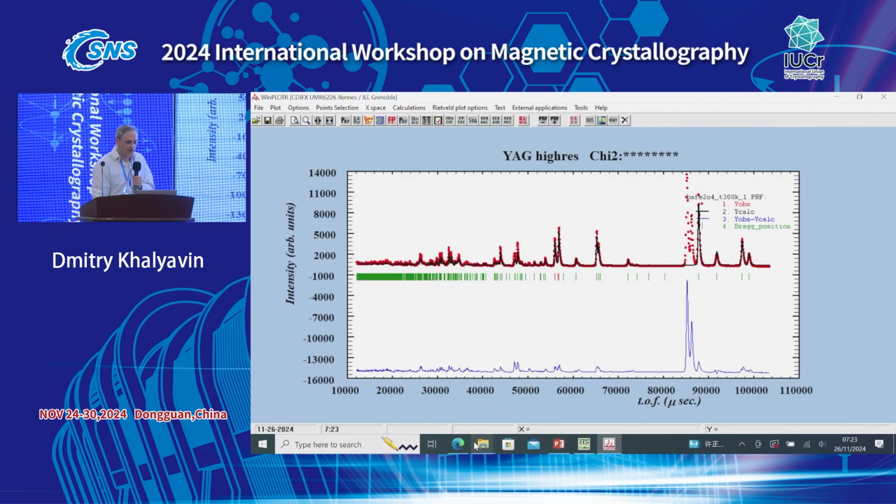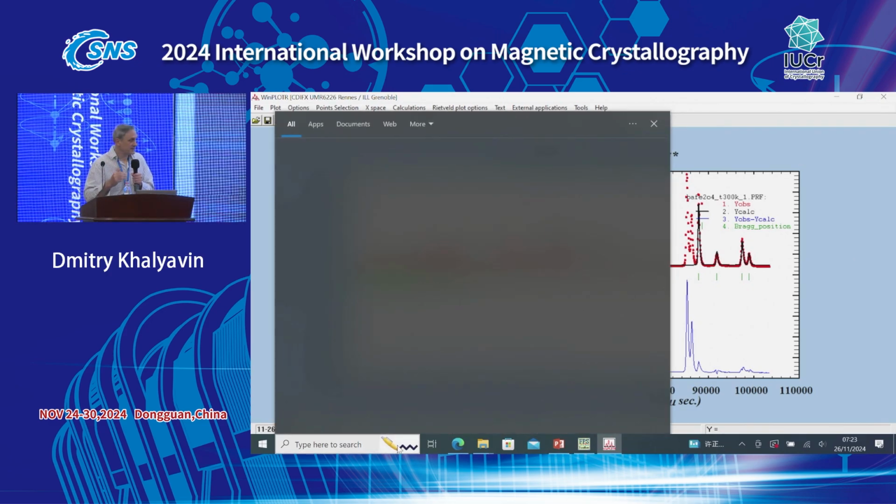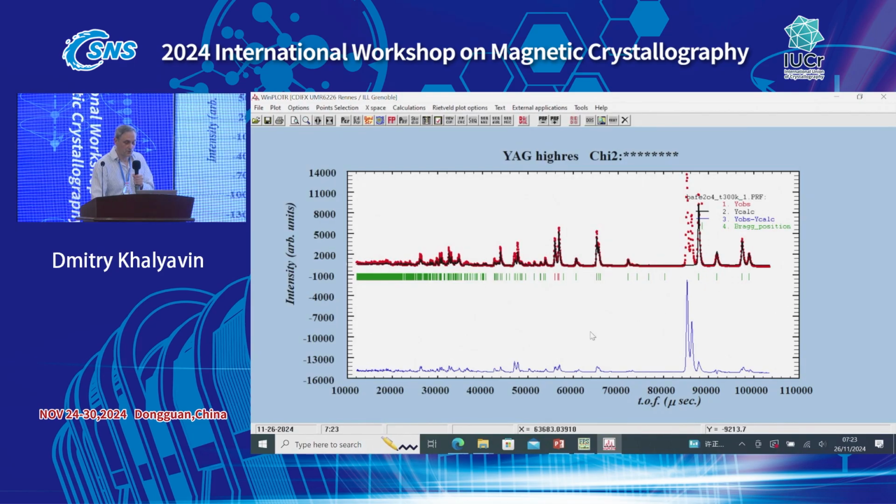And then, as a next step, as Manuel explained yesterday, we can use another Bilbao tool, which is called MaxMagn. So we generate maximal magnetic isotropy subgroups, because as we discussed, that is the most likely case, our solution will be one of them.